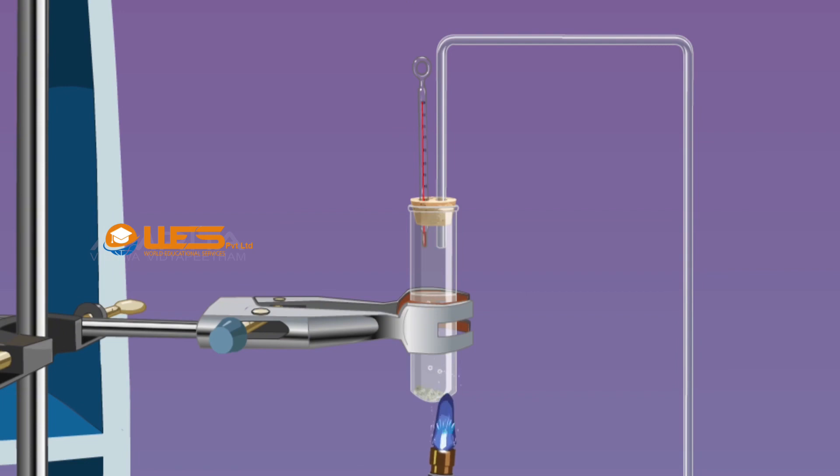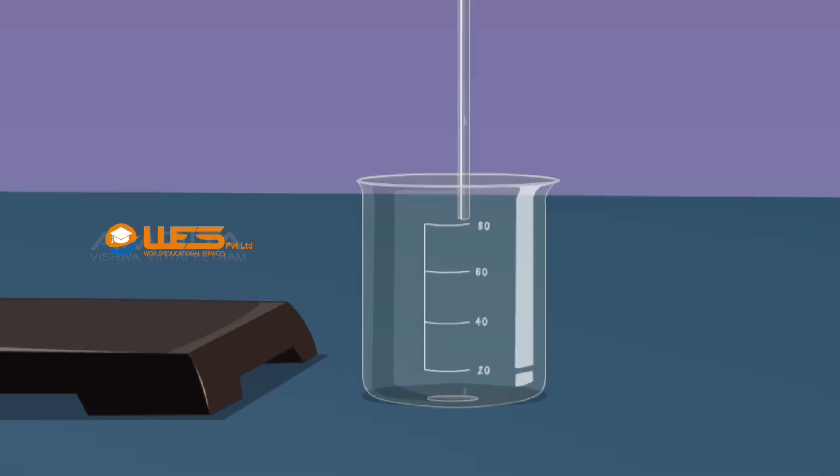On boiling, water is converted into steam which passes through the delivery tube, is condensed, and gets collected in the beaker.